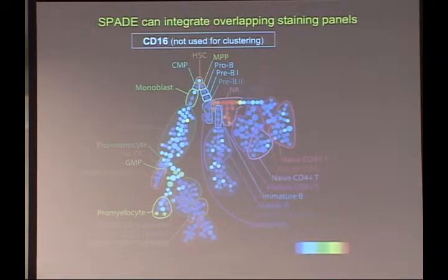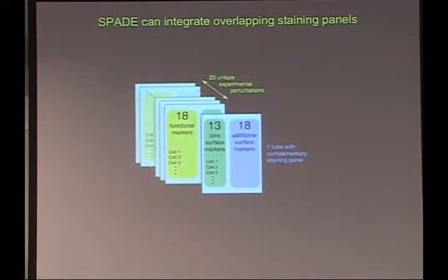And so that's how they got the name NK cells in our published data set. We also see CD161 and CD7 on those cells as well, and CD56. So it was really a beautiful example of how SPADE can pick out information in the data that you didn't even know. Like, I never would have guessed that we could pick out those NK cells with the markers we had.